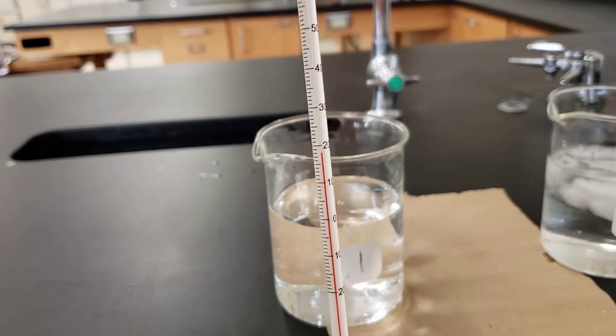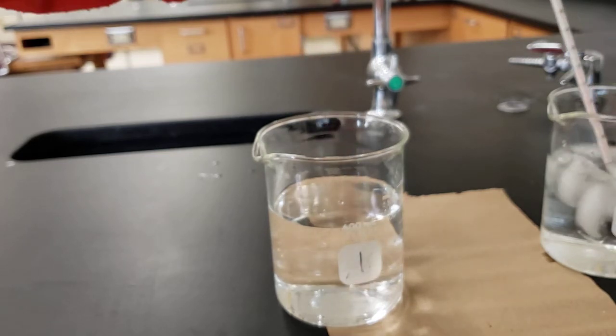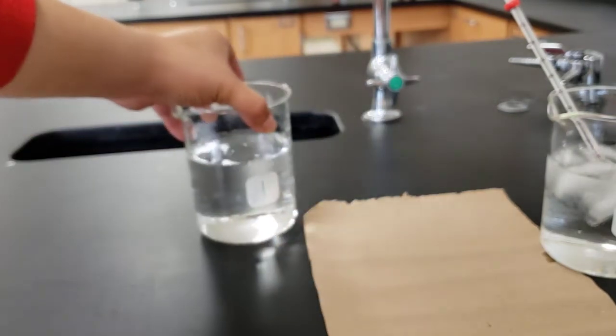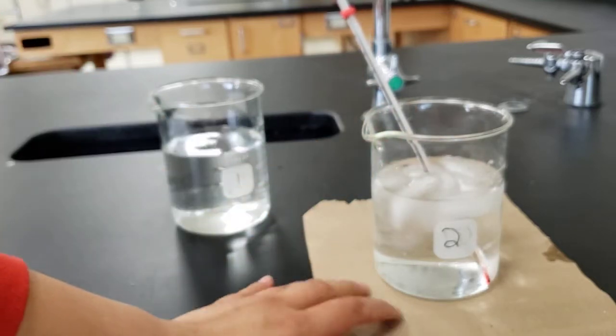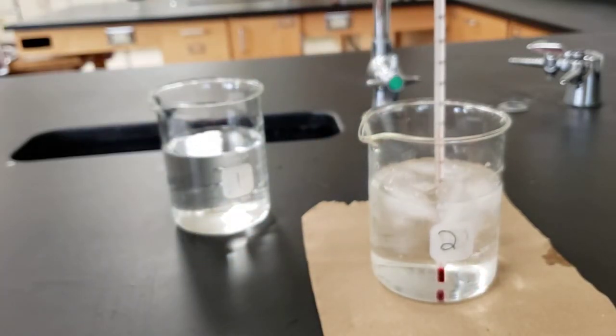All right, let's go ahead and take a look at beaker number 2. Again, we're going to put our thermometer in here. We're going to give it about 30 seconds to a minute. This one should be much quicker. Give it about 30 seconds or so for the temperature to stop changing.